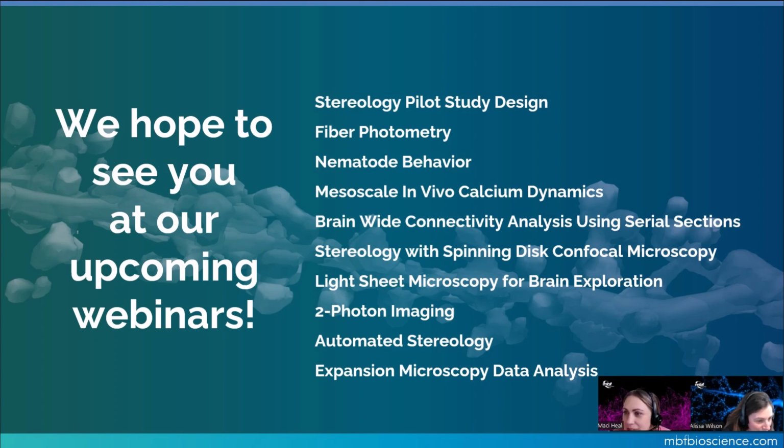There's one here about the number of nodes, and I think in the example I had filtered the report by number of nodes, so it looked like the number of nodes for each of the anastomoses were 15, but it was actually many of them had 15 nodes, but not all of them had 15 nodes. So I just want to clarify that. But that would be a way to measure the vessel branching through the branch structure report for vessels and looking at the number of nodes in the selection.